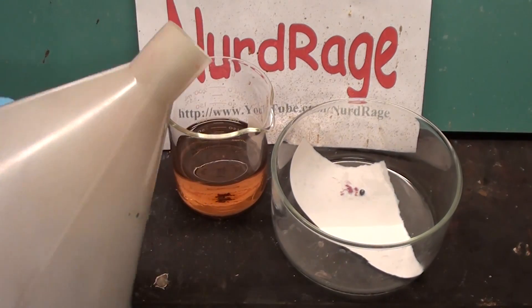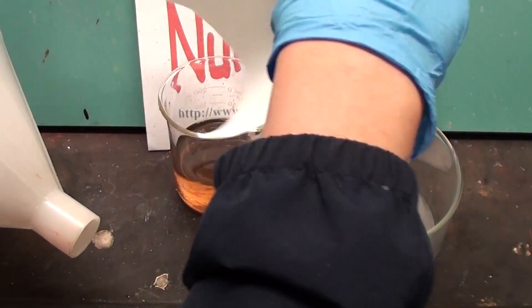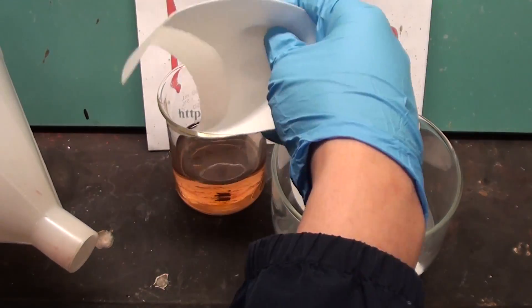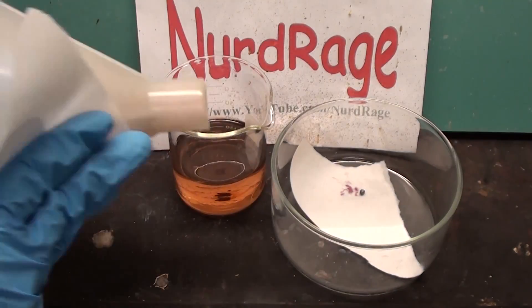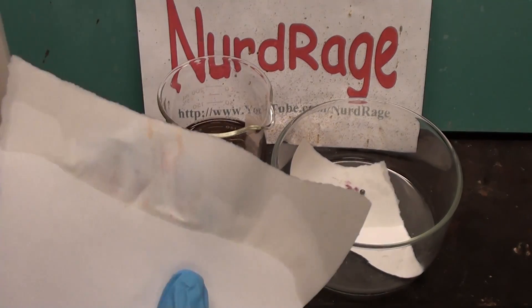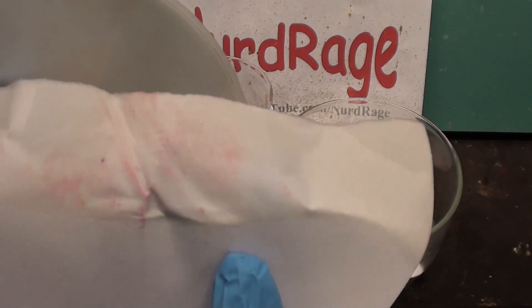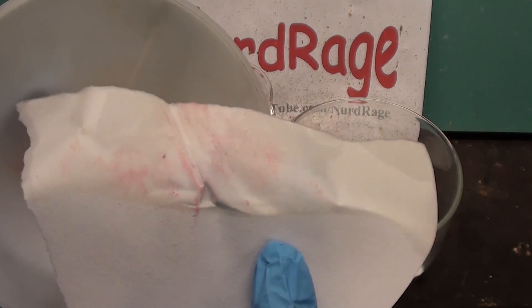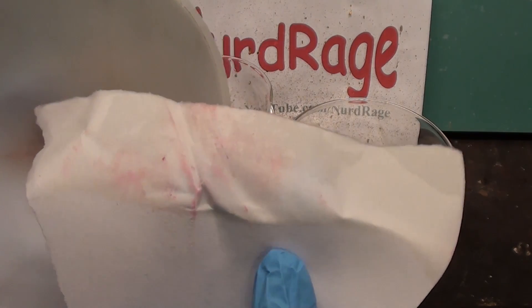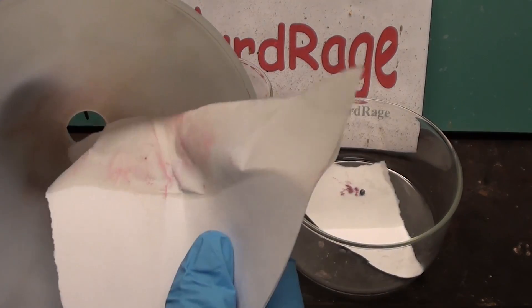Now I have here a funnel that was used to filter a lead containing solution. And although it was cleaned let's see if we can still detect lead on it. Not much on the outside. What about the inside? And there it is. The purple color shows there is a trace but detectable amount of lead still in the funnel. Looks like it's going to need some more cleaning.